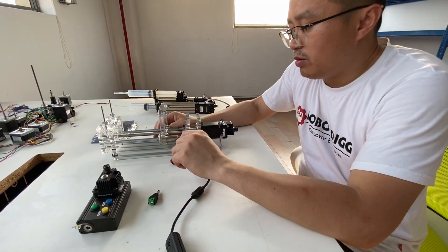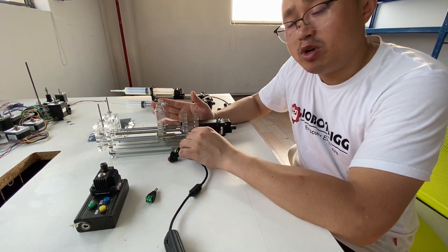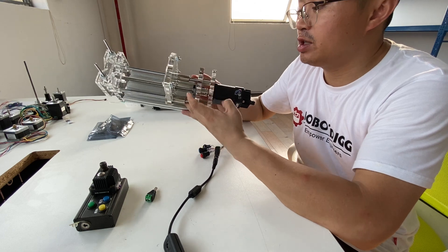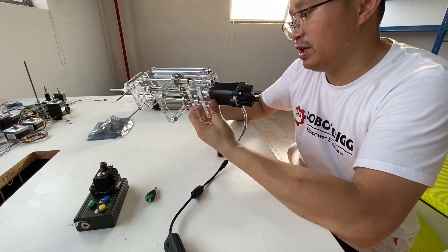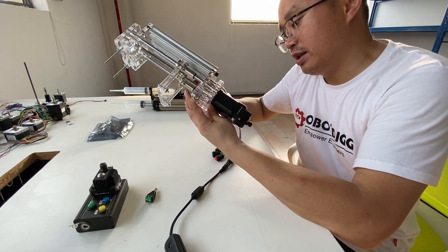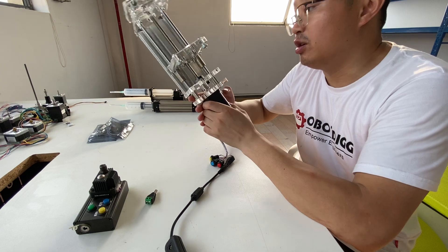Hi guys, this is Tiger from RobotDigg. Here you can see it is a DIY syringe pump build. I think there are many requests for such a model, I mean a syringe pump.